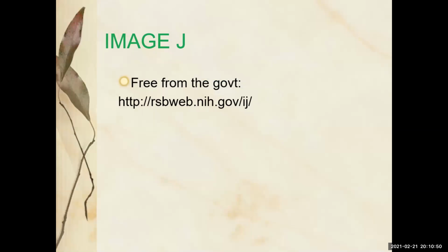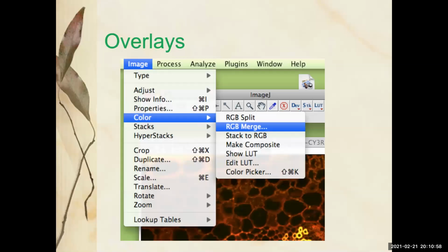So it's just silliness, but it's open source software and it's free from the government, and you already downloaded it for lab. So you already know that. It's your tax dollars that paid for it. Now, it's very simple looking, but it's very, very powerful. And it can do a ton of things. And unfortunately, it's built as a menu of all possibilities, equally weighted. So they don't really have buttons up front that say here's the 5 things you'll always do every single time you open up ImageJ.